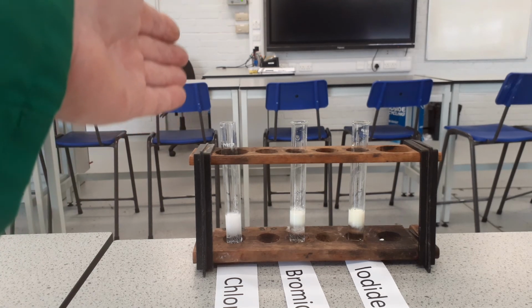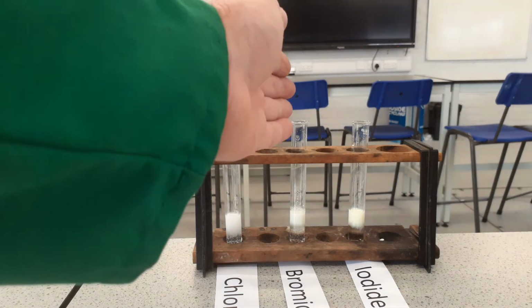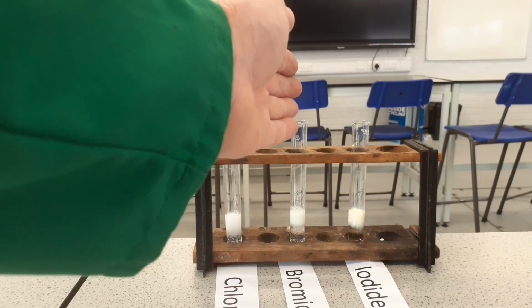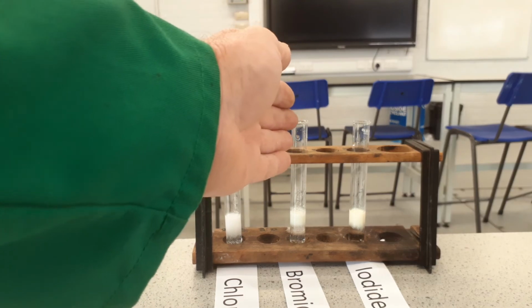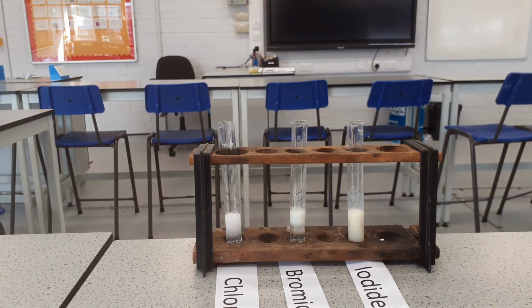Chloride gives you a white precipitate of silver chloride. Bromide gives you a cream precipitate of silver bromide, and iodide gives you a pale yellow precipitate of silver iodide. So that is all the tests that we need to be able to do.